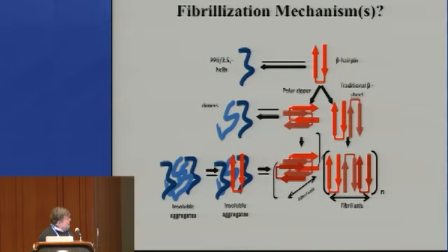We have a set of peptides that we have discovered is in a polyproline 2, 2.51 helix equilibrium, like the polylysine I told you about, that was previously thought to be random coil. We can also place the system in a beta hairpin.